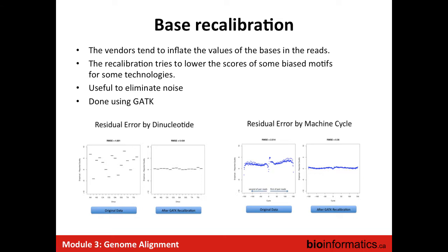So now with the new reference, BWA and other types of aligners have developed a strategy where you inform the aligner of where you expect to see these haplotype patterns. The read will be mapped normally, but if it falls in a region that is marked, it will add a mark to the read. Then you pre-process your BAM file, and it will specifically go to the haplotypes and redistribute the reads between them, and not mark the read as unmapped. So the new versions are haplotype aware, but you need to know the haplotypes in your reference. So, as I said in my first answer, it's really a question of the quality of your reference.